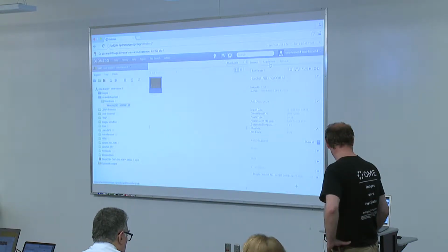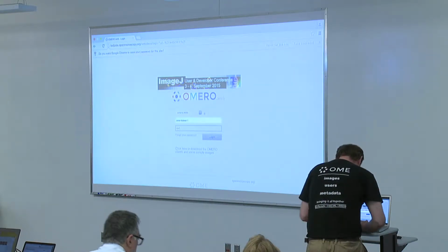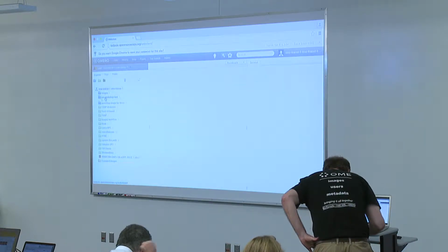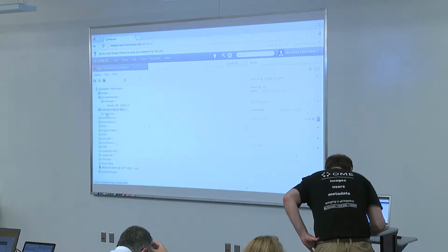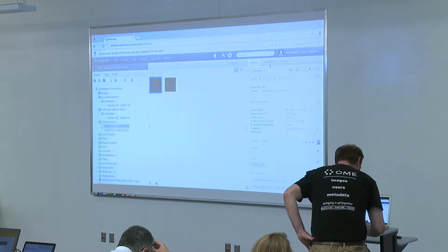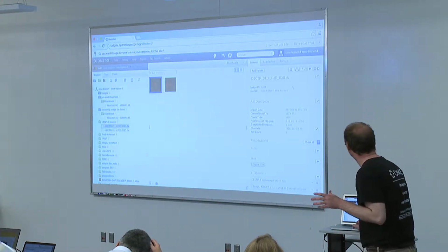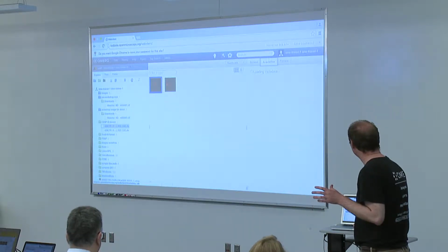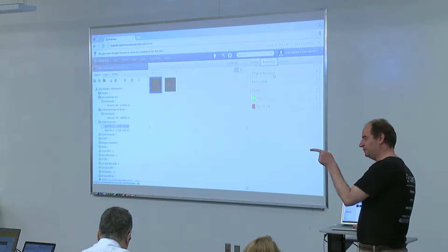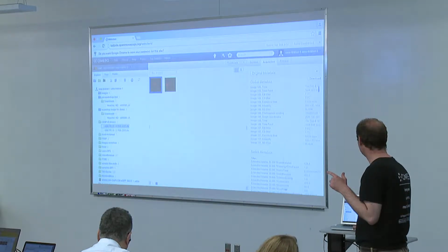Yeah, so there are two tabs. Let me show them to you. So these are the data which we read, okay? These are the data which we consider the most important. That's why we are putting them into this first general pane. Then you have the acquisition pane, and you have two tabs here. First of all, the one which is called original metadata, that's the one we were asking for. These are untouched, and they are as they are. Okay, these are the original ones.